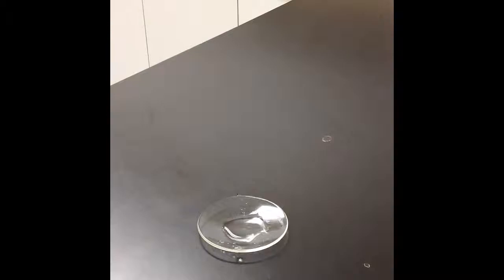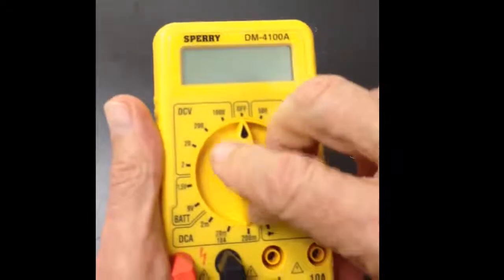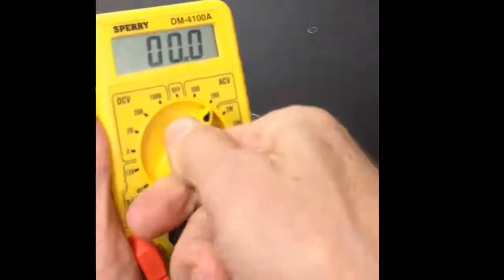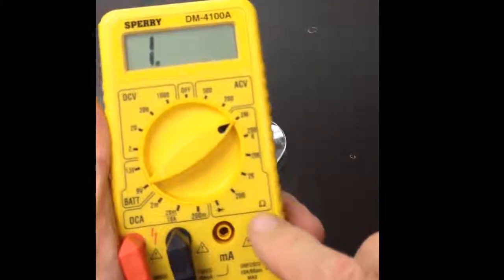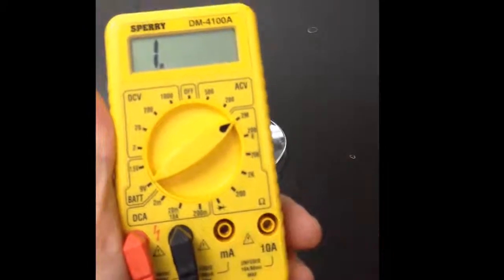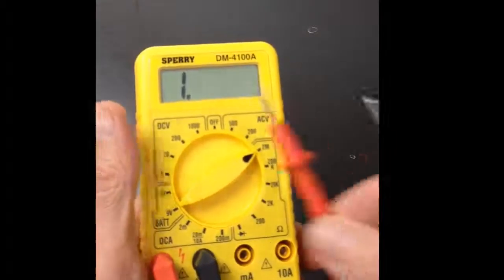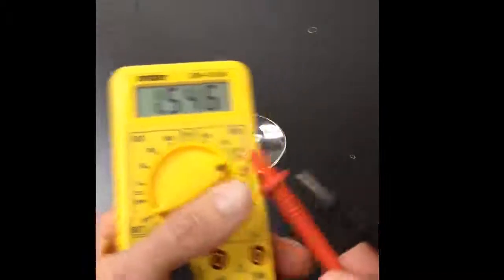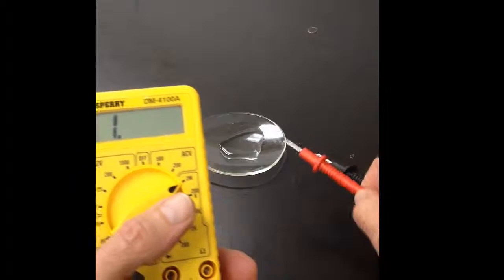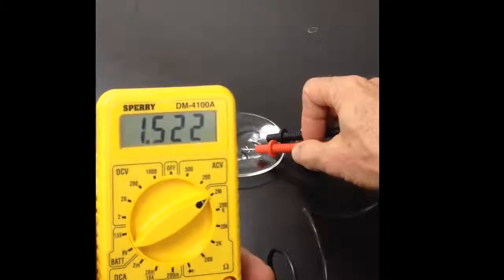We'll use a multimeter. As illustrated, turn the multimeter to ohms, and we'll use the highest setting on the ohm meter. When we place the probes of the multimeter in the solution, we'll test to see if the solution that is created by dissolving the substance will conduct electricity. If the number drops from 1, indicating there is no conductivity, to some number indicating that current is able to pass, we will record it as conducting electricity.